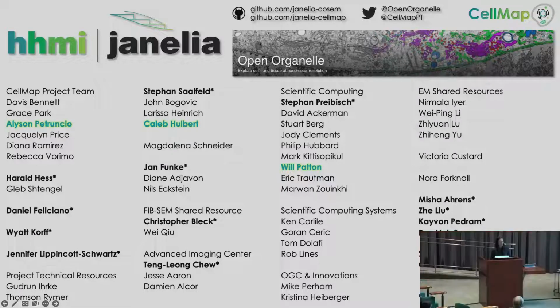Yeah, so I didn't show this because of the 15-minute time cap, but this is definitely something that we're exploring. The Hess lab and the Vetsey lab have those amazing cryo-correlative FIB-SEM and light microscopy setups, and it gives us a nice way to pair together super resolution of both things, right? And so we're looking into how we can use light microscopy to add either more function or just help us get more training data. Yeah.